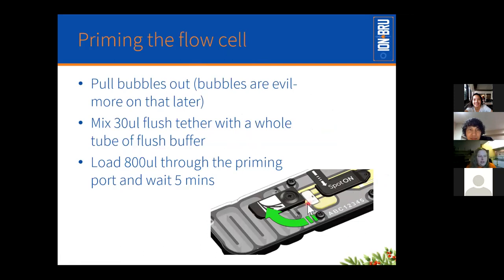When you first get your flow cell, you see here we've got some yellowy green fluid in all of the channels at this end. You can see this is the port having swung the cover open, and you can see there's no yellowy green just here, so that means there's an air pocket, and you need to remove that before you try and put anything in through that port, so you don't push the bubble towards the pore array.